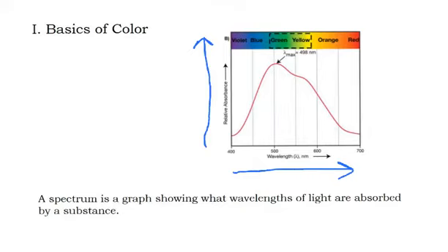It then drops off pretty smoothly to about 700 nanometers. What we're interested in for our experiment today is the lambda max, the wavelength where the absorbance maximum occurs. Lambda is the symbol for wavelength, and we put a subscript max on there to indicate the absorbance maximum. In this picture, the absorbance maximum for this compound is 498 nanometers, which is in the green range of the spectrum.